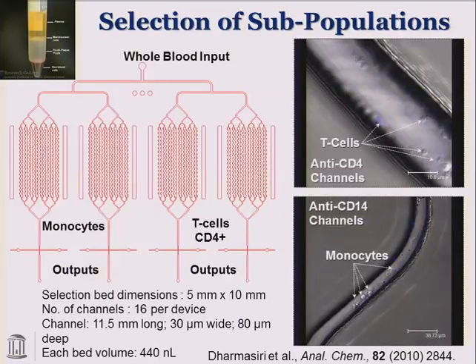And there's no reason that we can't put the CD8 antibodies here and the CD4s to look at different subtypes of those T cells. We could also look at B cells here as well. So in one pass-through, we can actually pull out the 4 subpopulations that we're particularly interested in looking at. How is this done? How do you get these antibodies into here, here, here, and here?